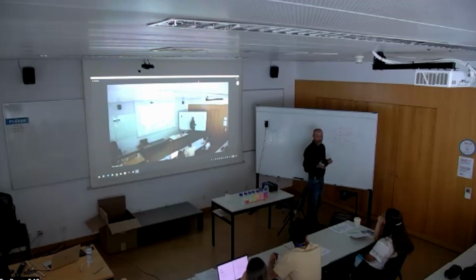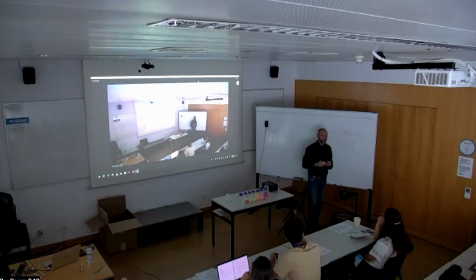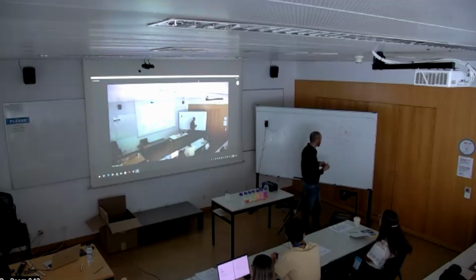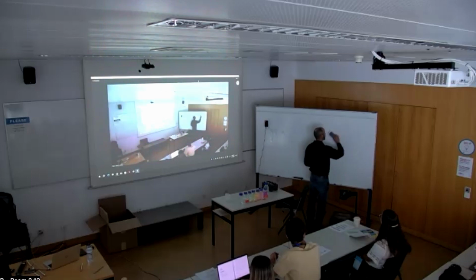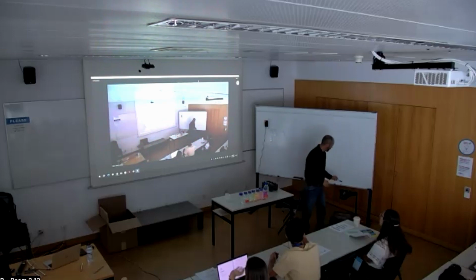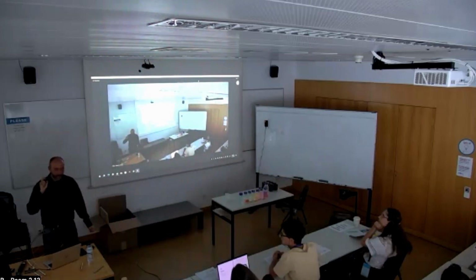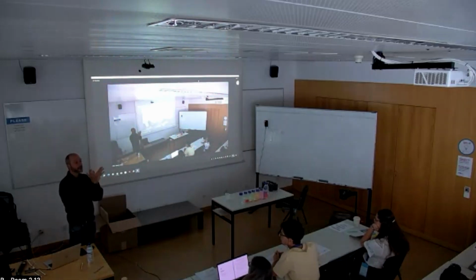And then he showed that this depends also on wavelength, because when you have the same numerical aperture and you cannot resolve in red, green still squeezes in because it diffracts less. So resolution depends on the numerical aperture and the wavelength of observation, which is exactly what Abbe then described mathematically, right? So for the first time, this set of experiments showed beyond any reasonable doubt that the image formation was due to interference, and that the minimum resolvable distance was directly dependent on the wavelength, and inversely dependent on the angular aperture of the lens.